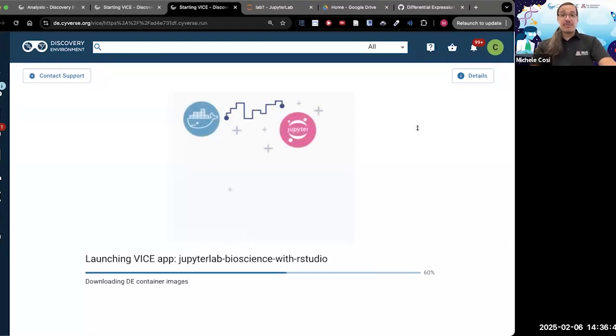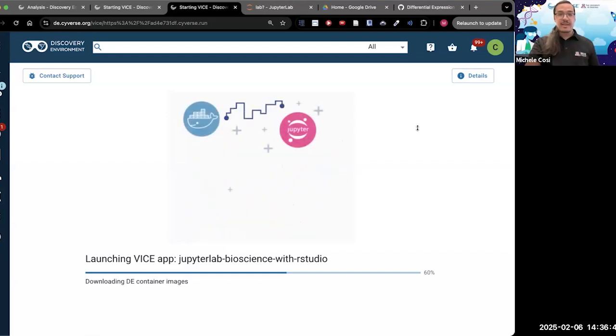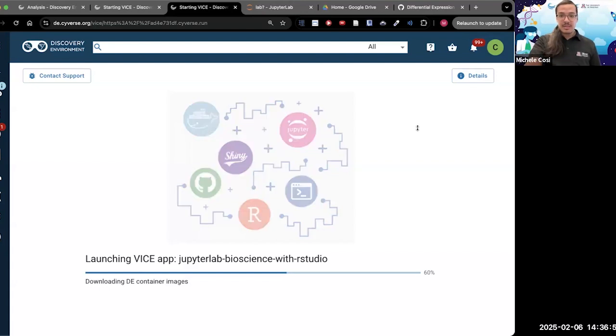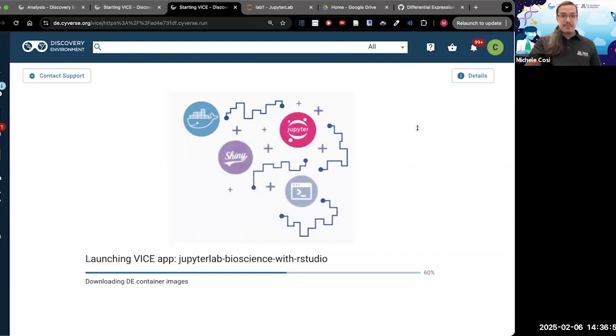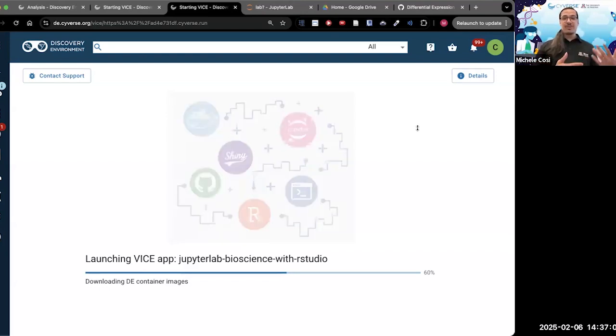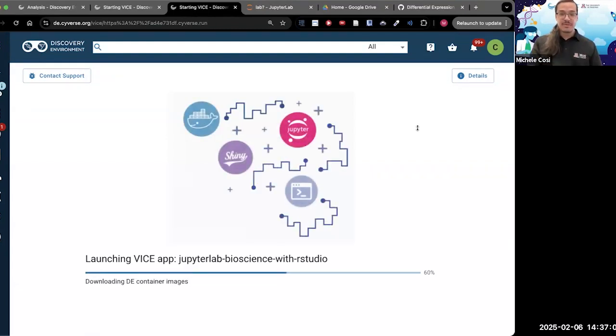And if there are publications that have a similar experimental setup, do they also explain what they did with their trimming? Maybe you're typing, but by all means, this is the first thing I would do: see if there is a paper out there that has done something similar to what I have to do.